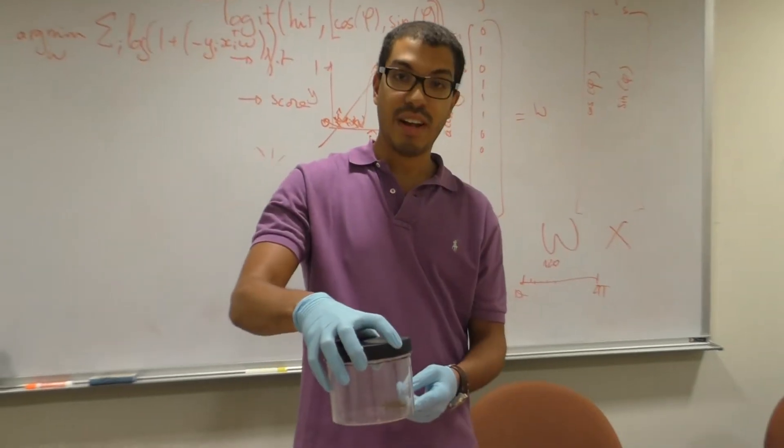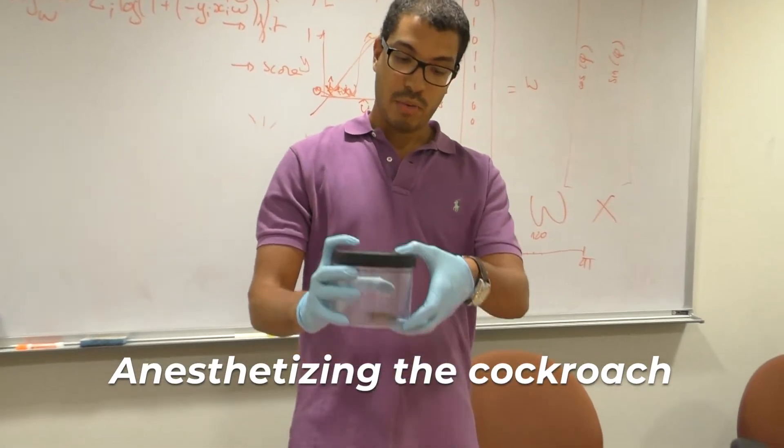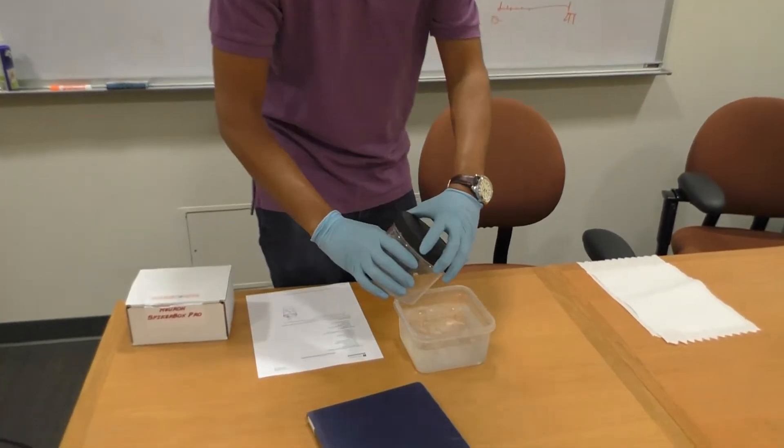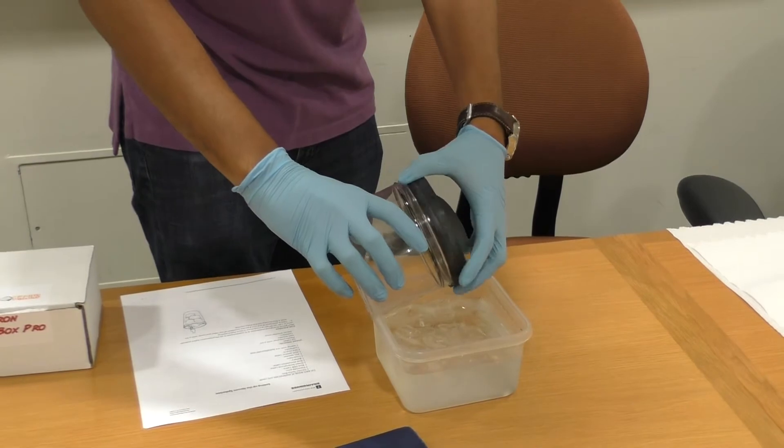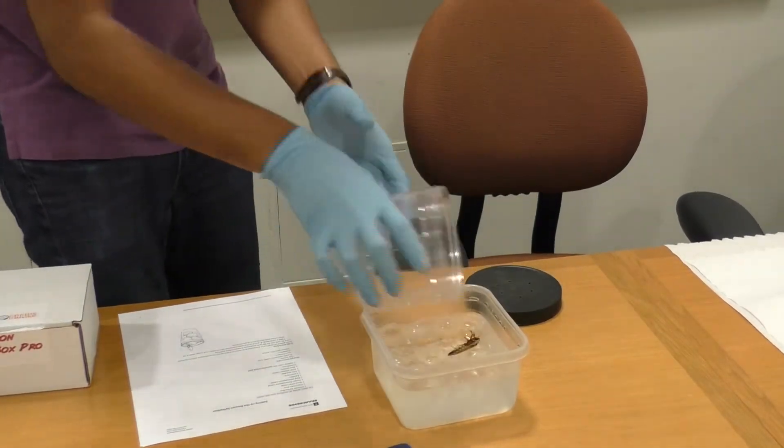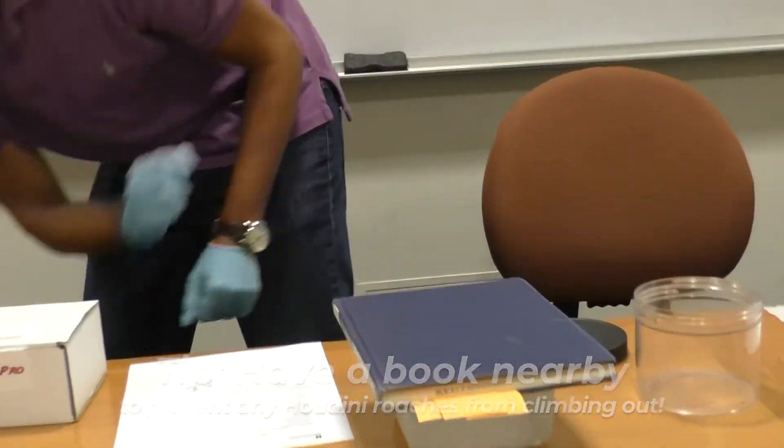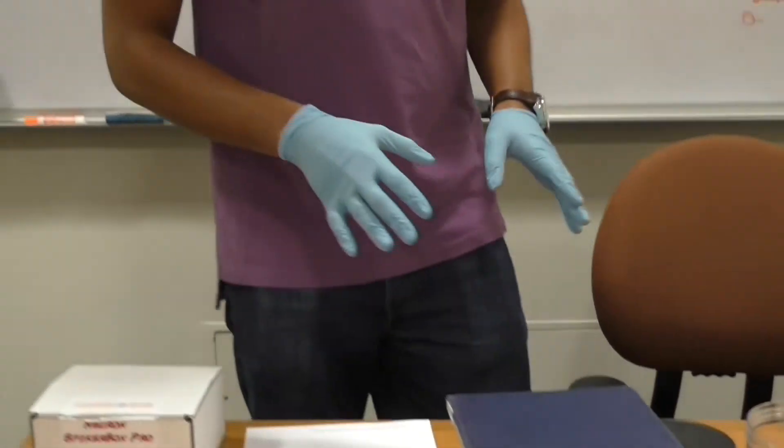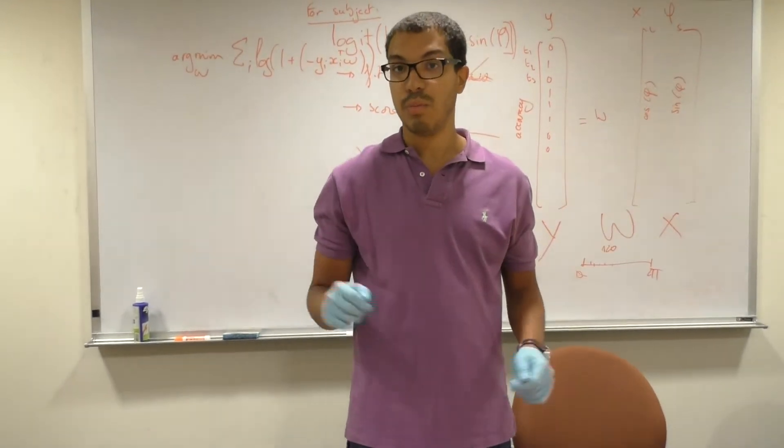What you want to do is you want to anesthetize the roach by putting it into ice water. So you find wherever its home is and you're going to just dump it in the ice water. You can open the container and just pour it in like that. And it's always good to have a canopy to put right on top to make sure that the roach doesn't squirm out or anything. It should stay in there for a few minutes just to make sure it's not moving at all to make it really easy to pull off that leg.